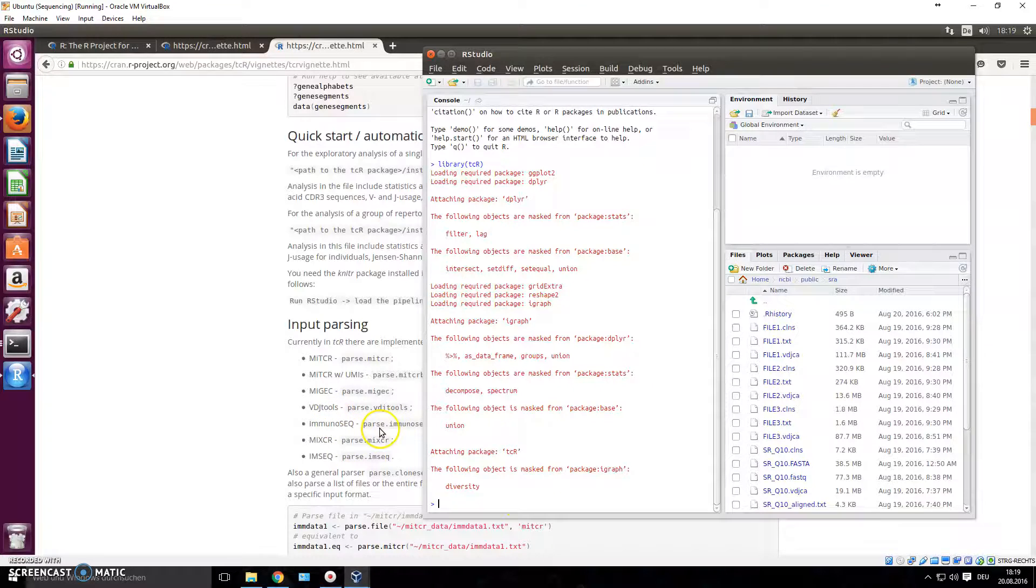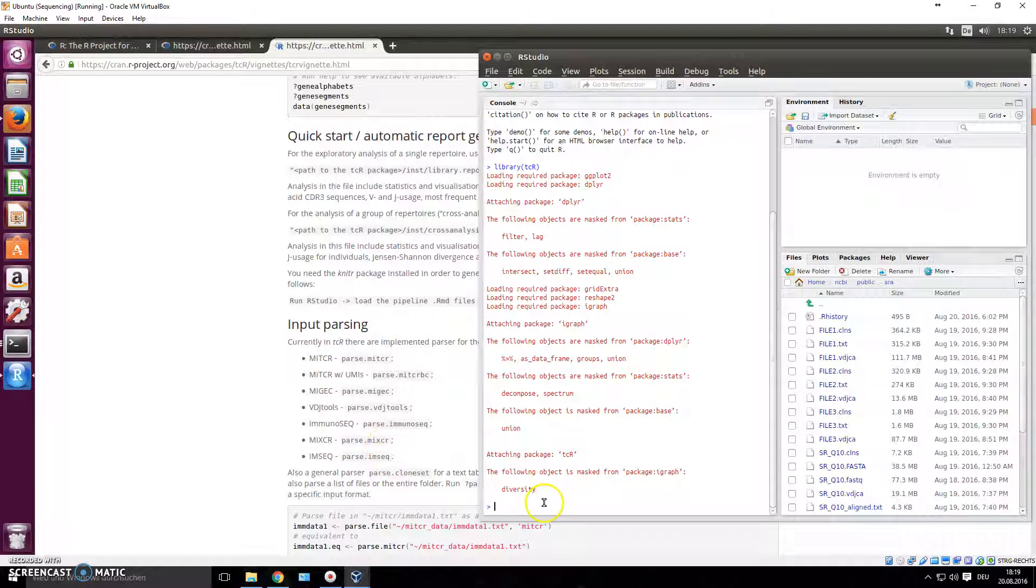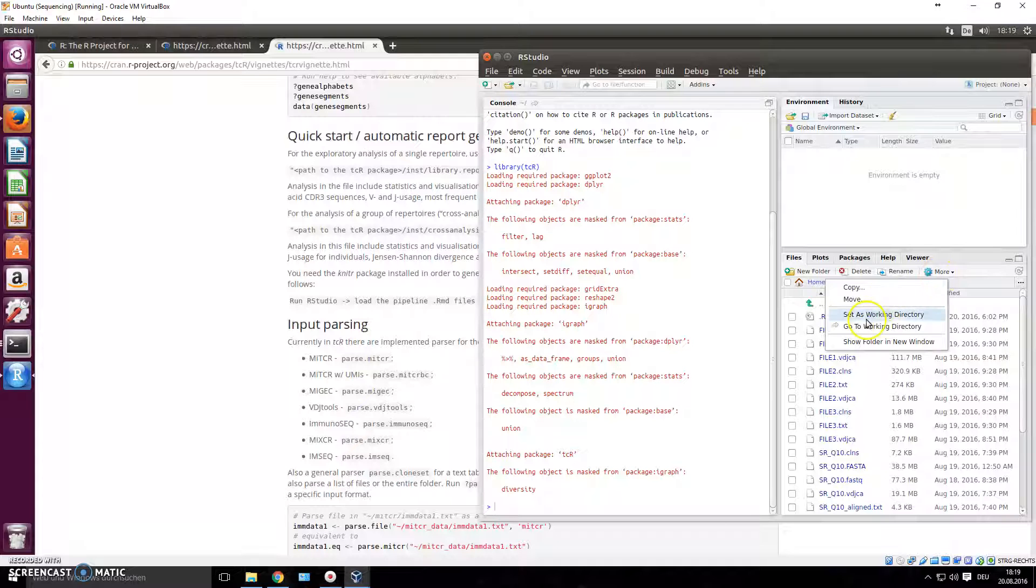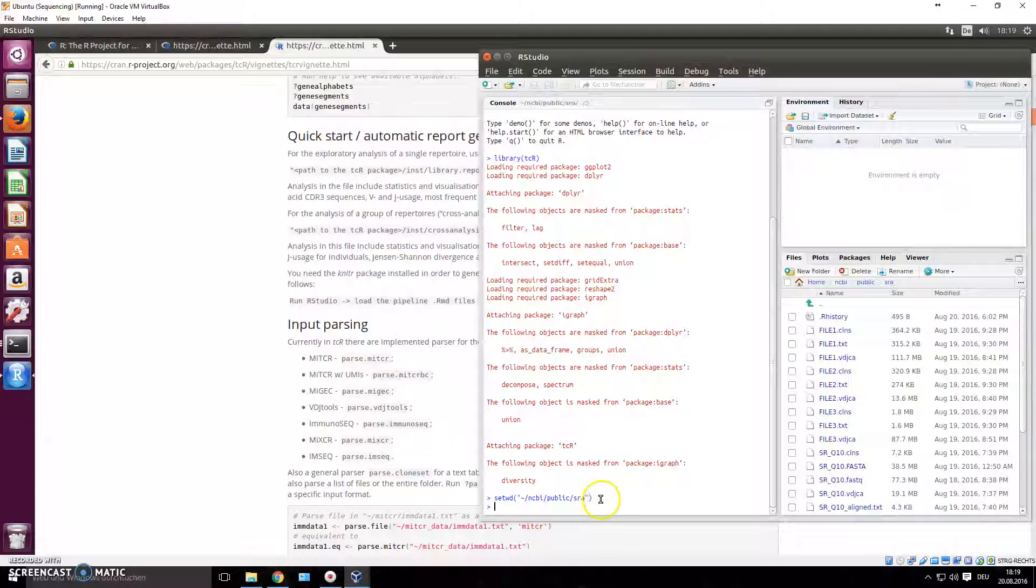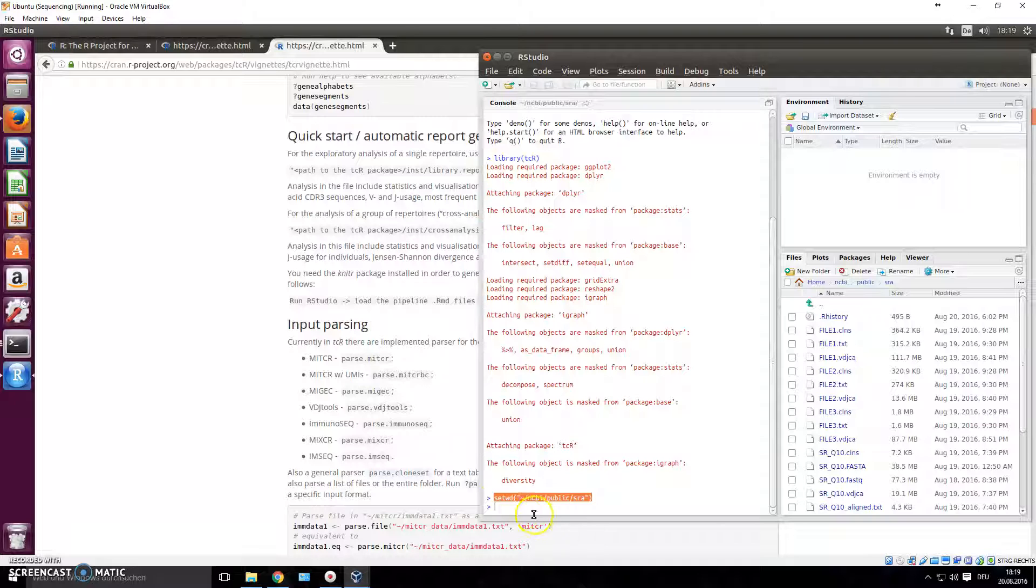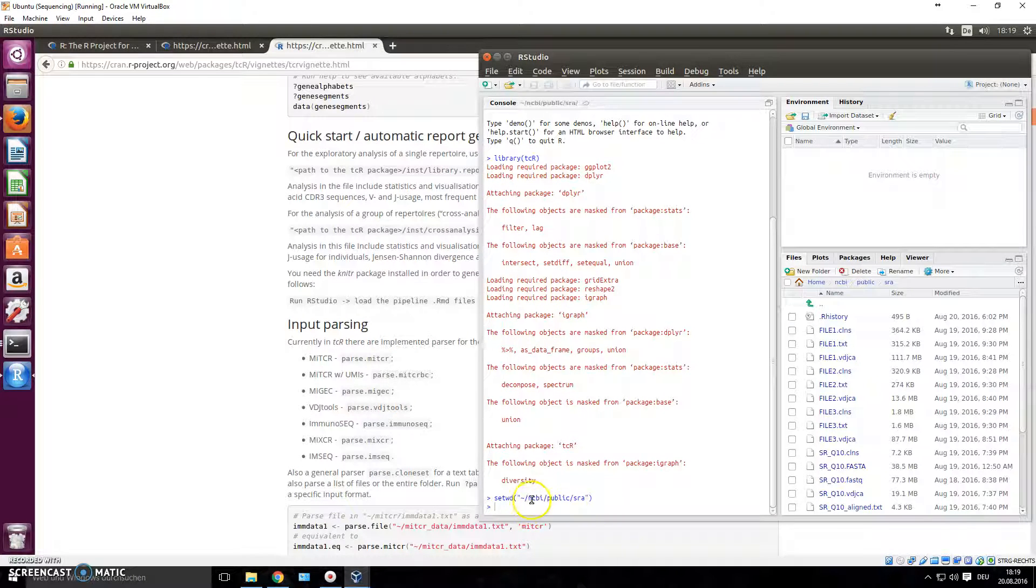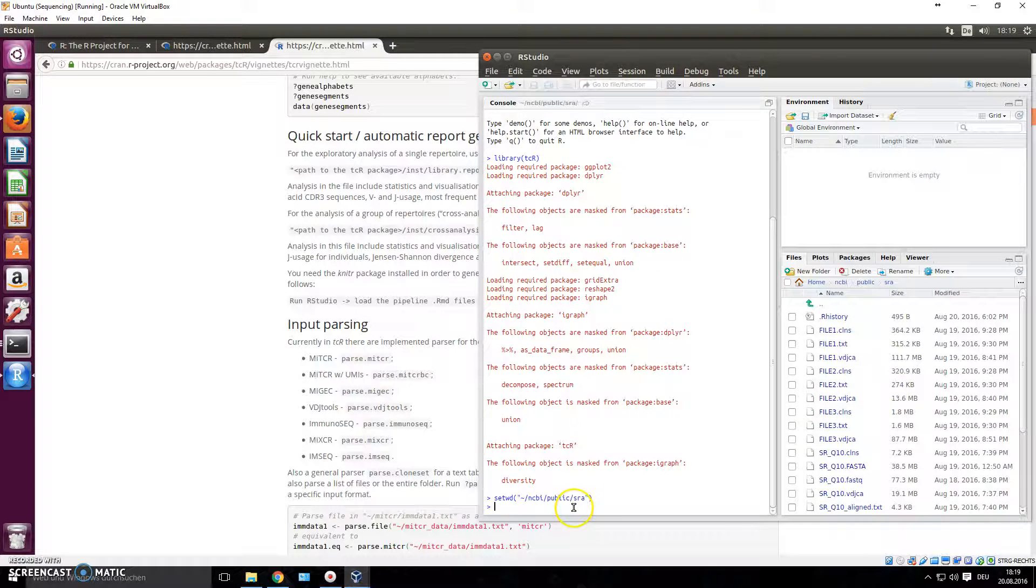You do this using this command - it says it right here: parse.mixcr. So the first thing you have to do is set this directory to a working directory. We go to More, Set As Working Directory. Now you see the command actually being executed here as well, so we could have just written setwd, open brackets, close brackets, and in between in quotation marks the path of the folder.